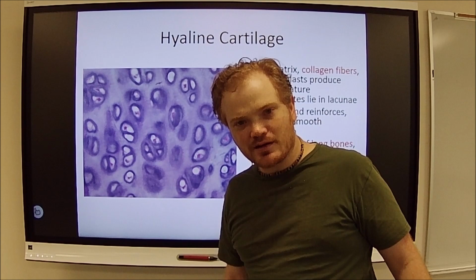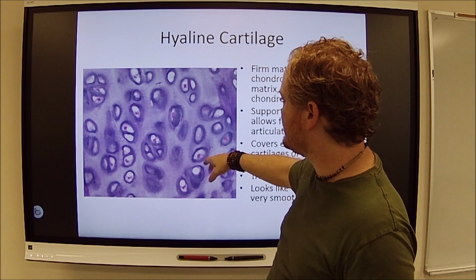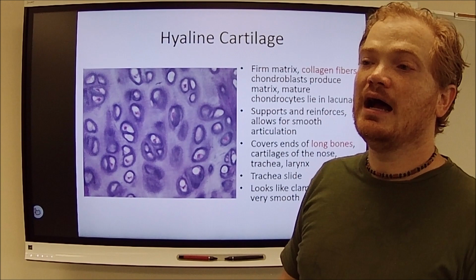This is because it's basically quite similar to these dense connective tissues like this. Very, very similar. You just can't quite make out all the fibers in the background. But this is mostly collagen. And a lot of water. Like, there's a whole bunch of water in hyaline cartilage and elastic cartilage, for that matter.